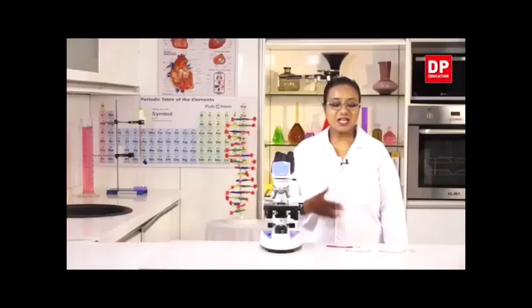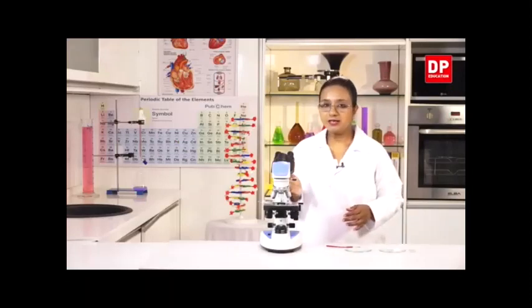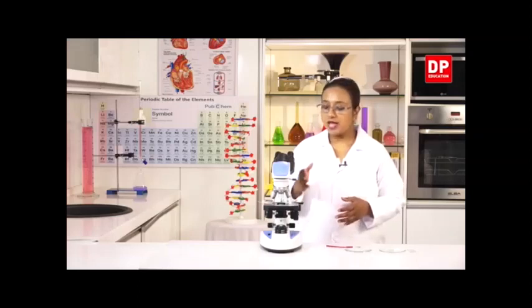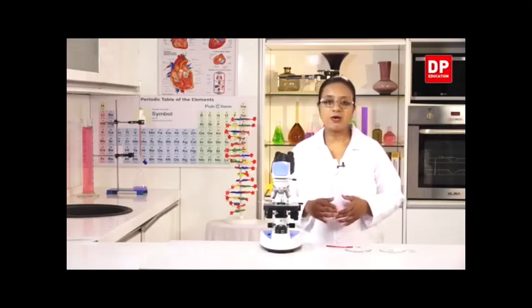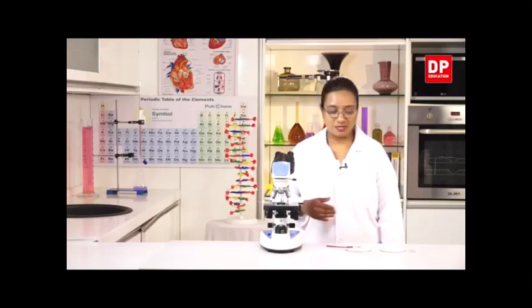Okay, students, now let us do this activity to observe the cheek cells of a person. For this, we will need a light microscope. As you know, this is a compound light microscope because it has two lenses, the objective and the eyepiece. Through that, you can clearly observe the cells of a specimen.